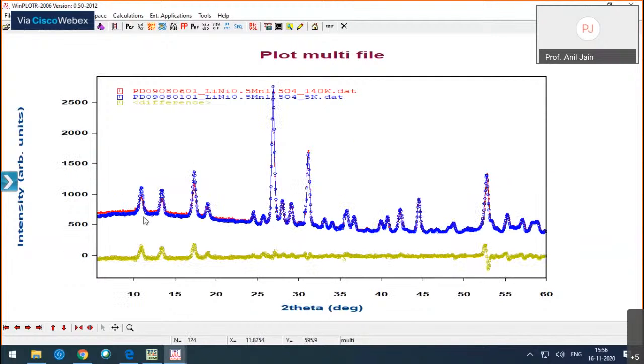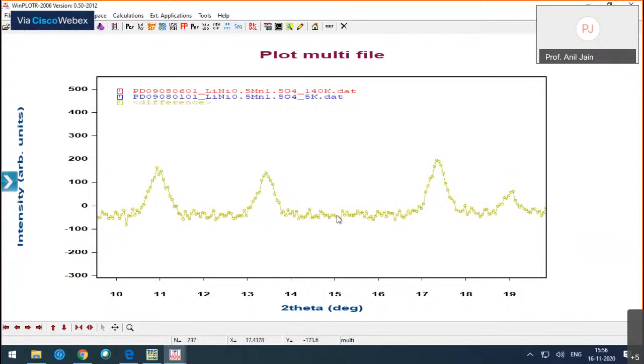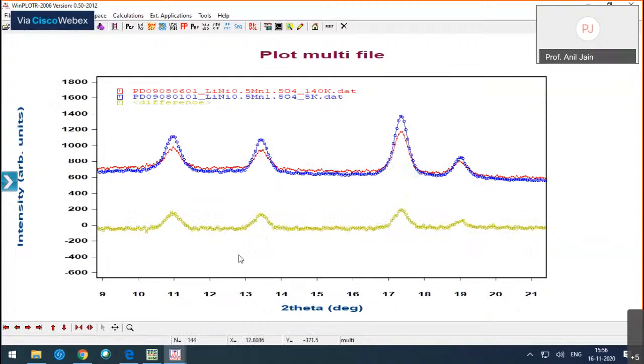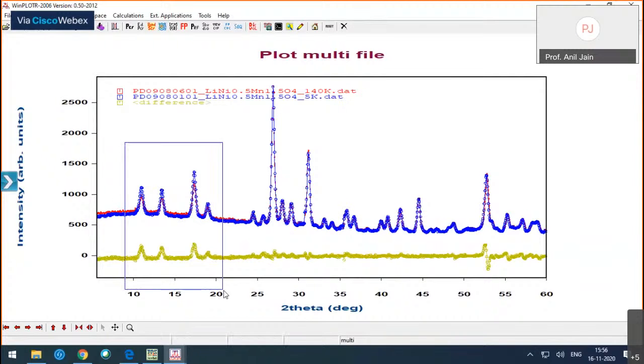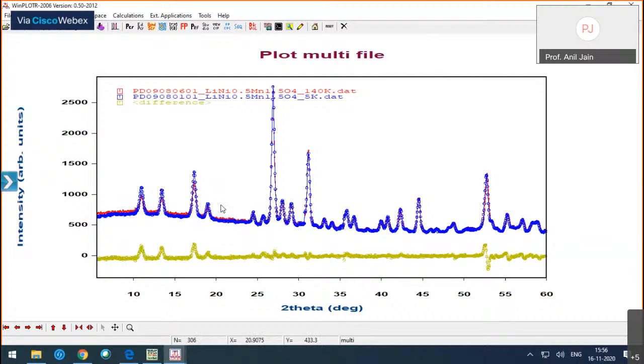So you clearly see that, apart from this lattice parameter fluctuation, there is an enhancement in the intensity at least at these 4 Q locations. Now we have to find out this K vector for these additional peaks. So what you can do is, this case is simple because you know that these peaks are on top of nuclear reflection. So this K has to be 0, 0, 0. But we can do it here. So what we know is these are the 4 peaks where we have additional reflections, additional intensity.